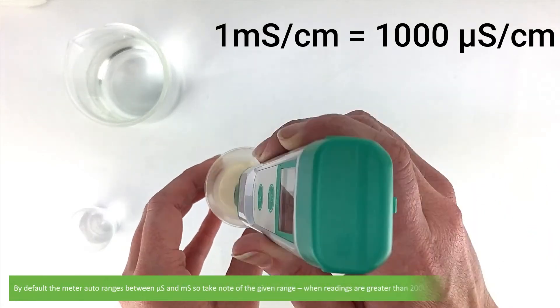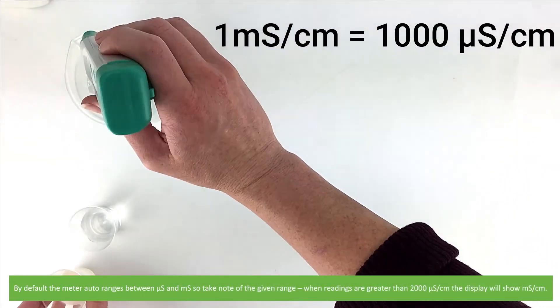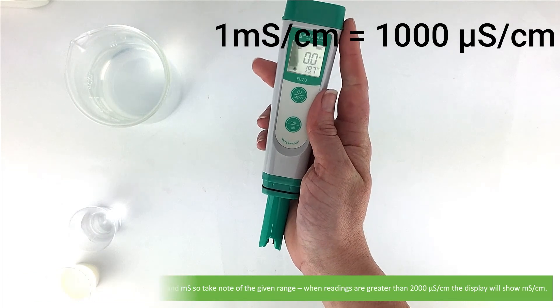By default the meter auto ranges between microsiemens and millisiemens per centimetre, so take note of the given range. When readings are greater than 2000 microsiemens per centimetre, the display will automatically convert to millisiemens per centimetre.